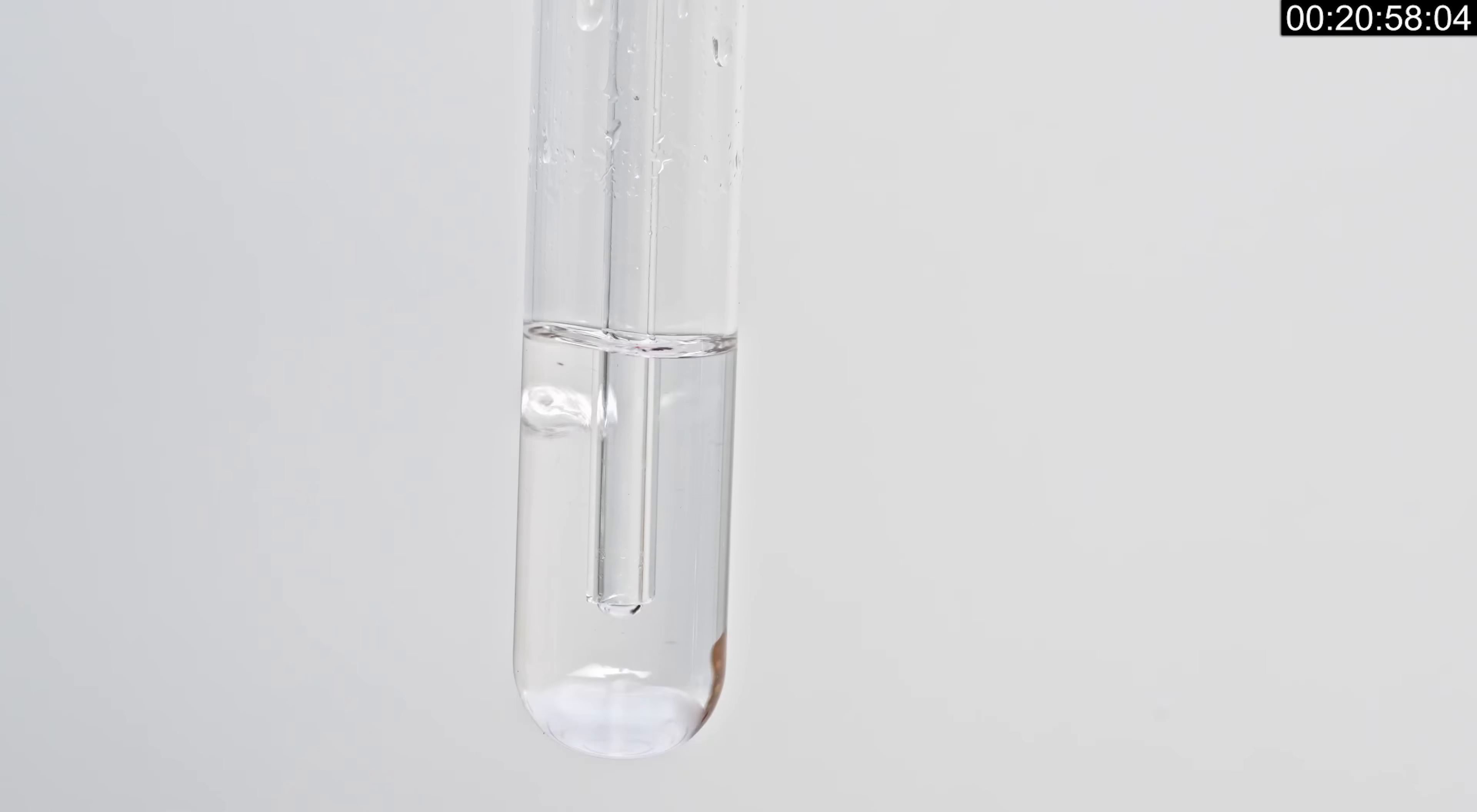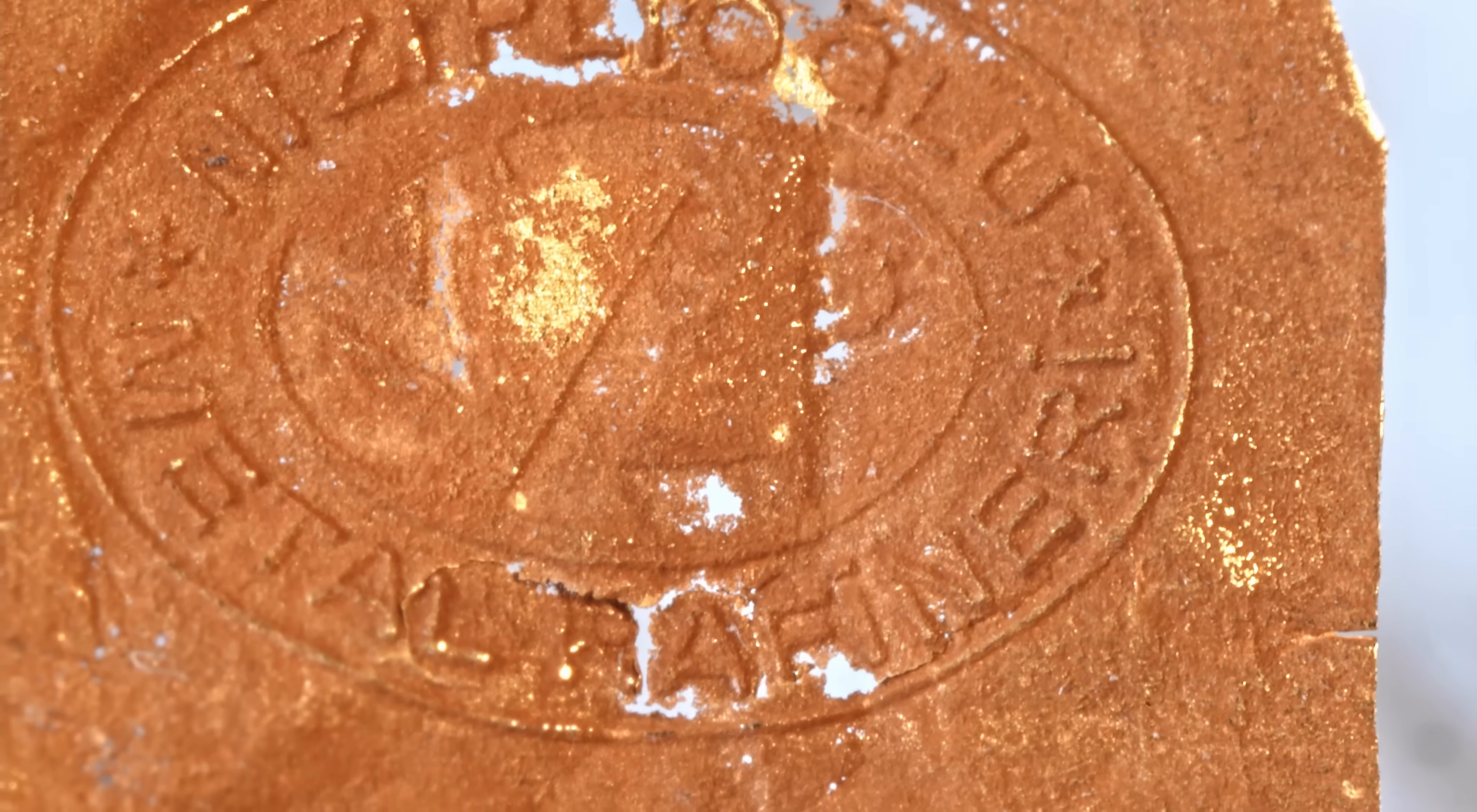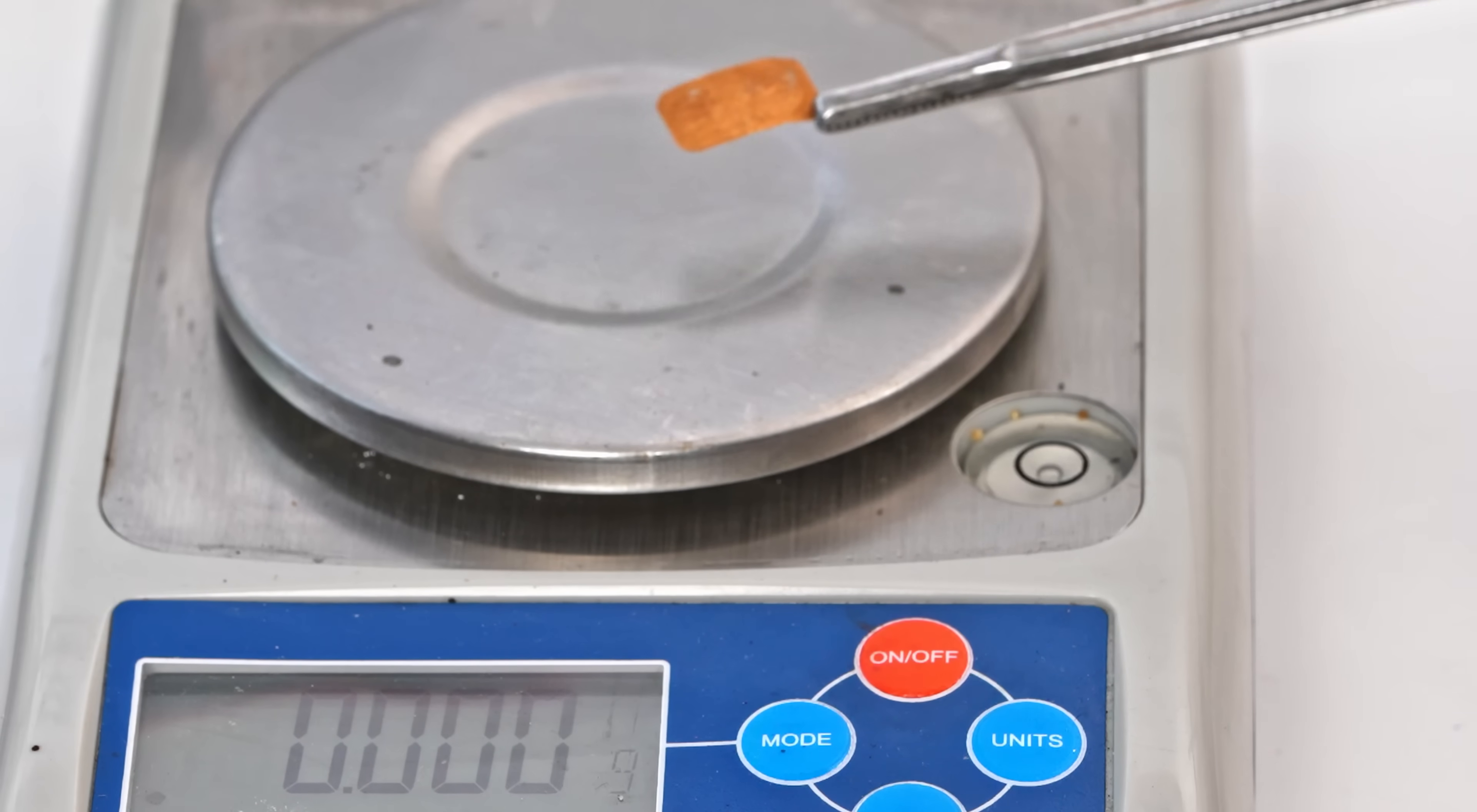I replaced the cyanide solution with a fresh one, and again dissolved the gold for more than an hour. This time, after removing the ingot, you can clearly see that in some places the gold has dissolved and micro holes have formed. I'm sure that this is a good sign that the ingot has been lost in mass, and indeed, on the scales we see less than one third of the initial mass of the ingot.